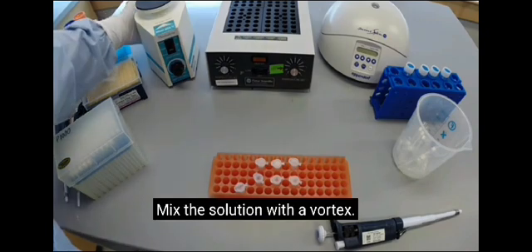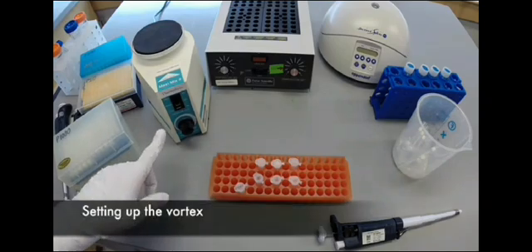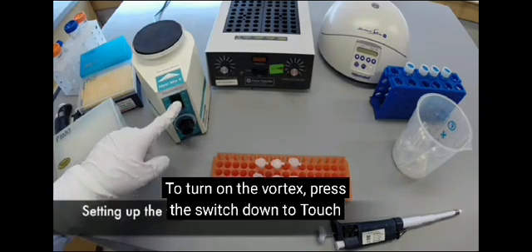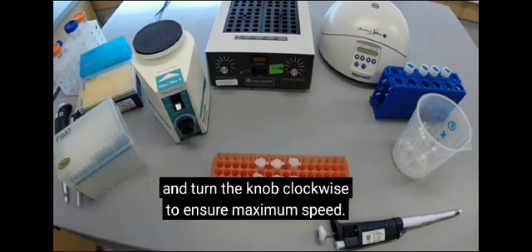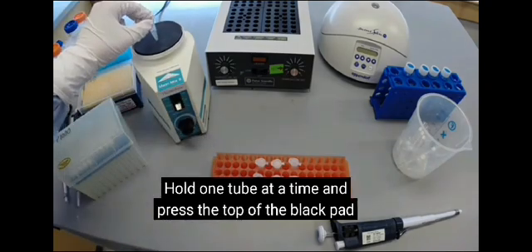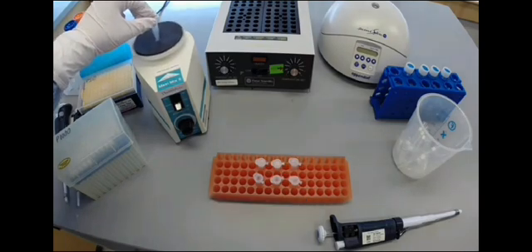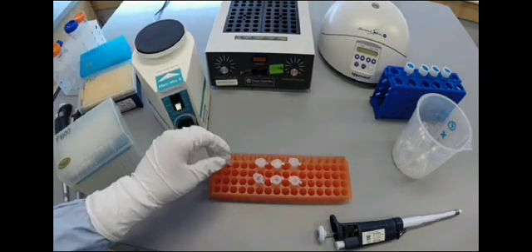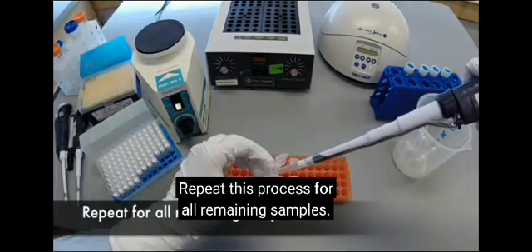Mix the solution with a vortex. To turn on the vortex, press the switch down to touch and turn the knob clockwise to ensure maximum speed. Hold one tube at a time and press the top of the black pad to initiate vibration. Repeat this process for all remaining samples.